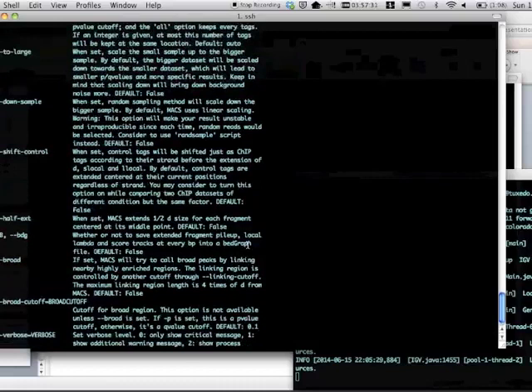And we are going to submit this job now, specifying sbatch. We can specify the job name. This is the name that will show up in the queue. So in this case, we can call this MACS2 ChIP-seq demo, and this will be the name of the job.